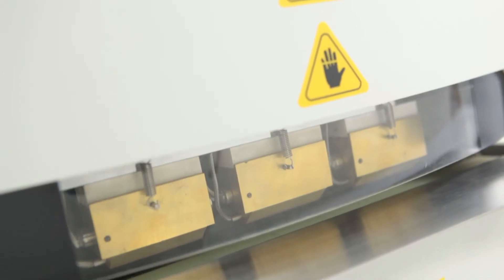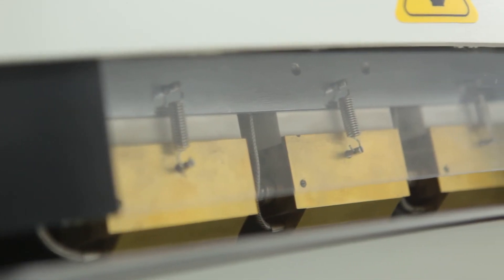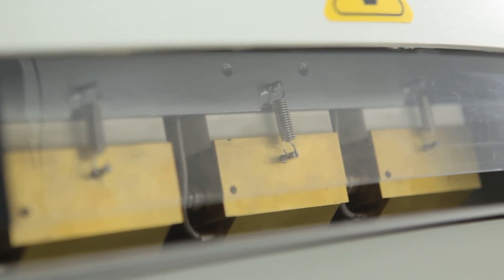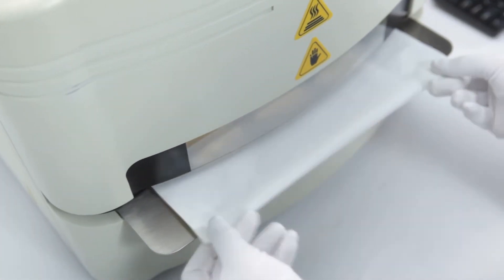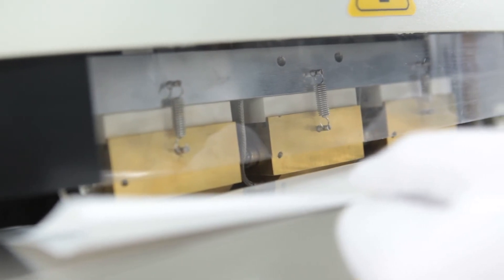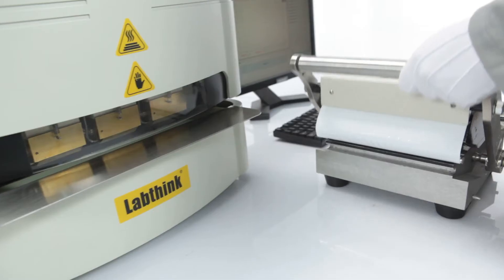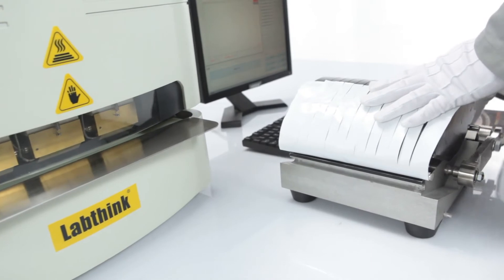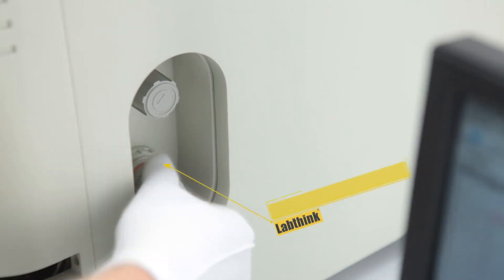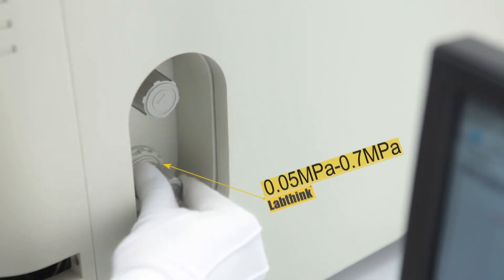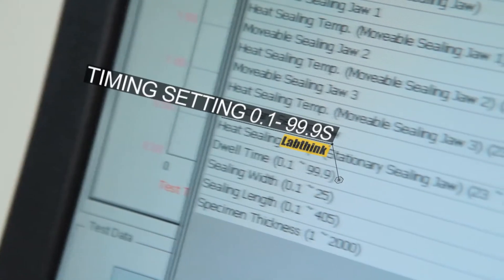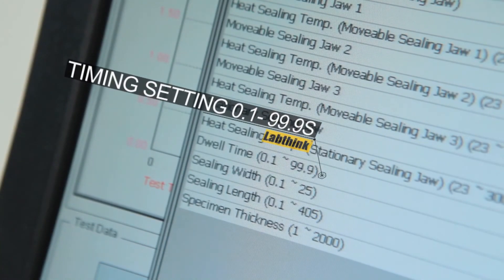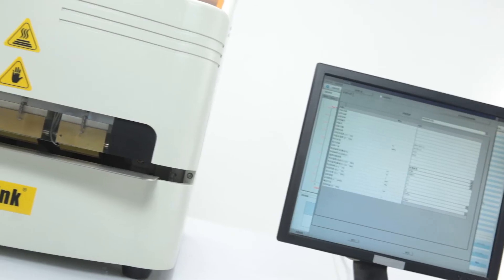i-Thermotech 2400 is equipped with three groups of upper sealing jaws and one group of lower sealing jaws that can all control the temperature independently. Thus the sealing tests of six specimens in three groups can be achieved in one single test.